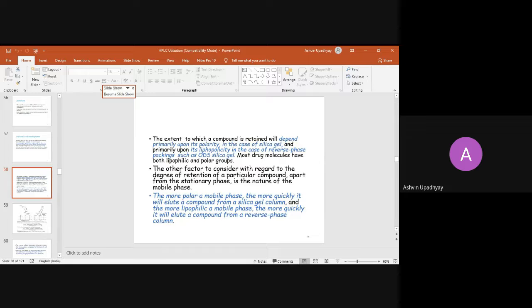So in active pharmas, in the APIs, active pharmaceutical ingredients, you may have to restrict that much of impurity, and with respect to that impurity level, you may have to change the mobile phase and the stationary phase to the optimum composition. Unless you get the optimum composition, you may face problems every time in the separation, the quantitation, and the qualitation of each analyte, each impurity.